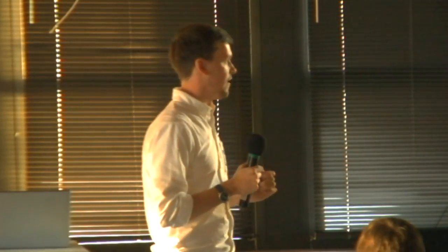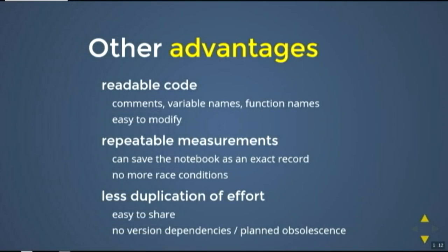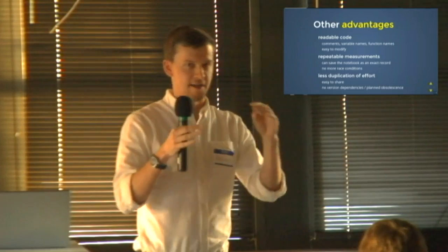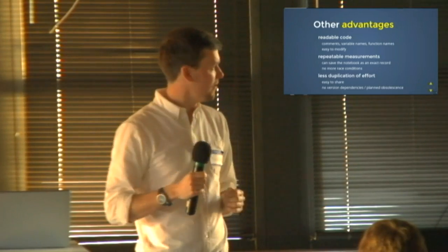And finally, there is so much less duplication of effort. The nature of grad school is that people are always leaving. People are always graduating. Fingers crossed. So you're always working with something you inherited from someone who's not around anymore. There's never somebody there who can say, oh yeah, I did this for this reason. But now with these notebooks, you can put a little markdown text and say, I'm doing this measurement. I did this weird thing because of this.